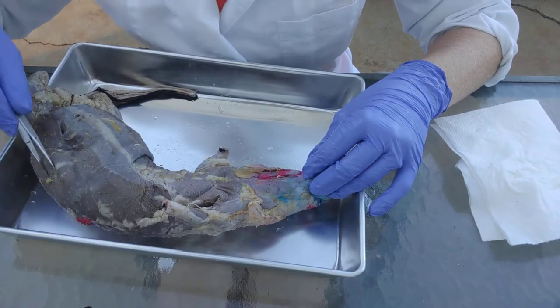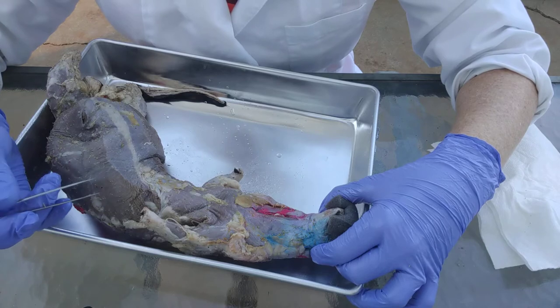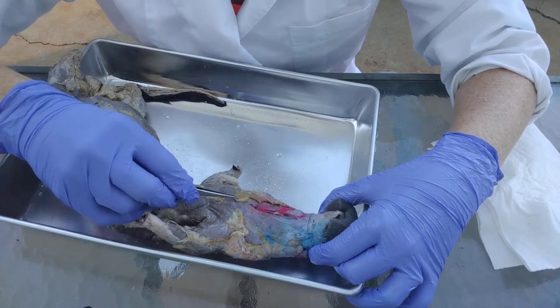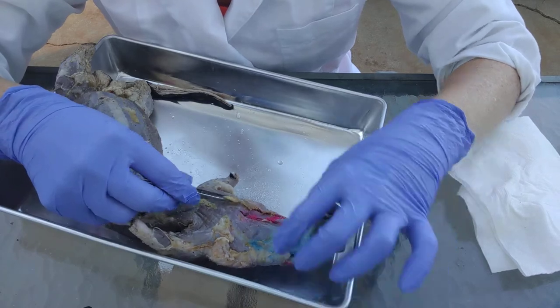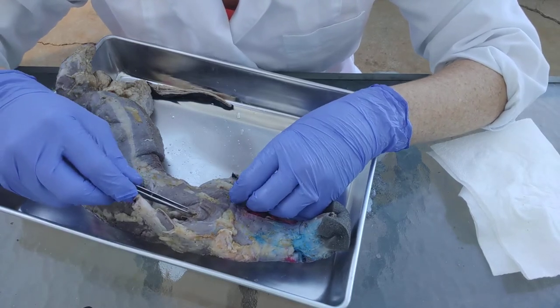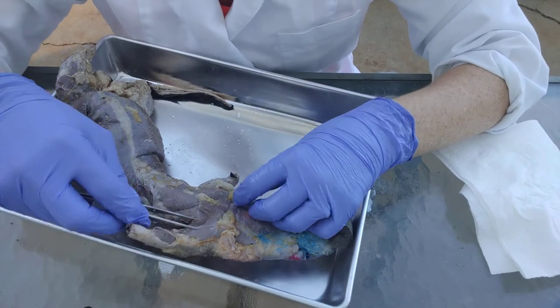If you look right here, our specimen — this is a mink — has already been skinned, so the skin is gone, but there's still a little bit of the hypodermis still stuck on it. Any time you see this yellow structure, yellow just means fat. If you feel the fat you'll notice it's very soft and has a different texture than the muscle. The muscle is meat, so if you have any familiarity with meat that you eat, that's what it's like.